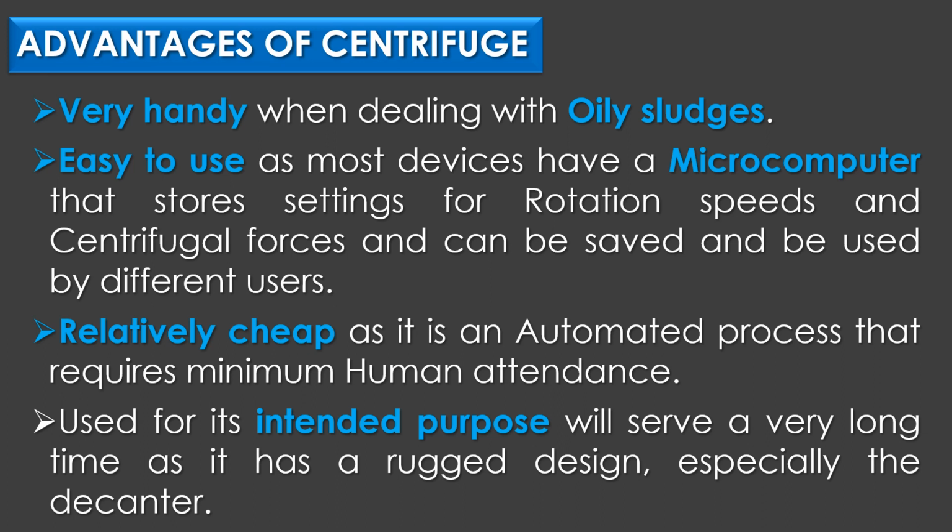The centrifugation process is relatively cheap as it is an automated process that requires minimum human attendance, thereby reducing the expenses associated with hiring manpower. Finally, the centrifuge, if used for its intended purposes, will serve a very long time as it has a rugged design, especially the decanter.